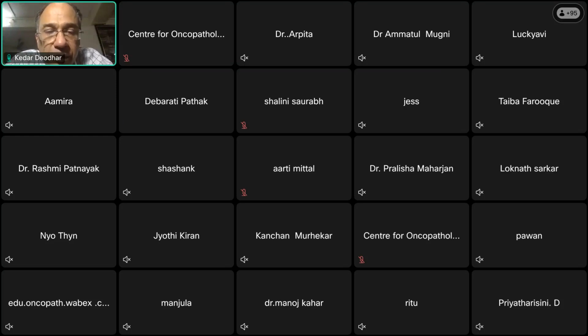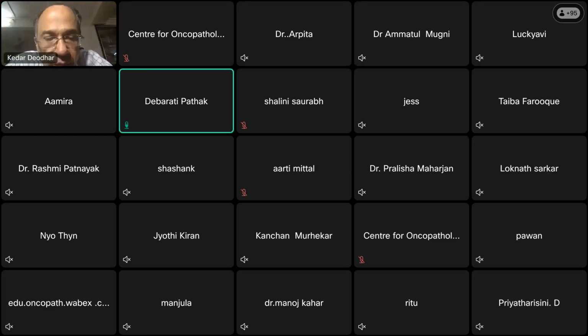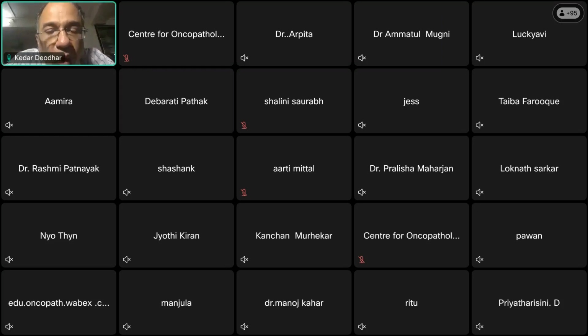Okay, sir. Is the ascending colon retroperitoneal or intraperitoneal? The ascending colon on the anterior aspect has serosal covering. The descending colon also has peritoneum on the anterior aspect. Posteriorly, there is obviously no serosa, there's only fat. So imagine if you have a circumferential tumor in the ascending colon, when you open it, part of the tumor will have serosal covering on the anterior surface.